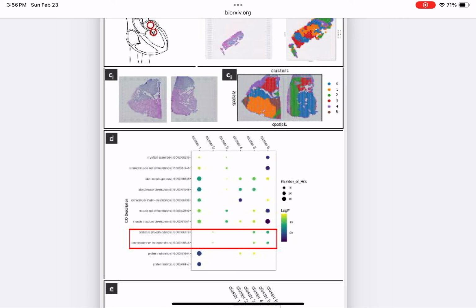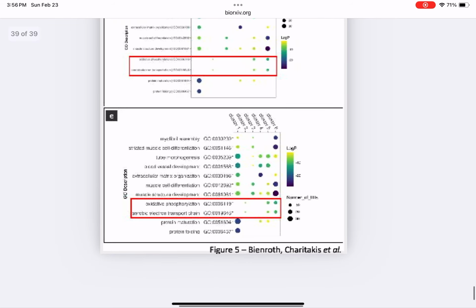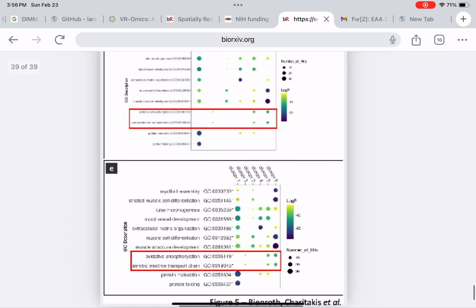Discussion. The number of multi-slice ST experiments is growing rapidly, 32, simultaneously presenting a great opportunity for spatial biology investigations and a data science challenge. To address the gap in technologies capable of handling multi-slice data, VR-Omics was designed from the ground up to manage multi-slice ST data, both coplanar and 3D stacked, through an intuitive, customizable graphical interface that requires minimal computational skills. Supplementary Figure 2, Supplementary Video 1.